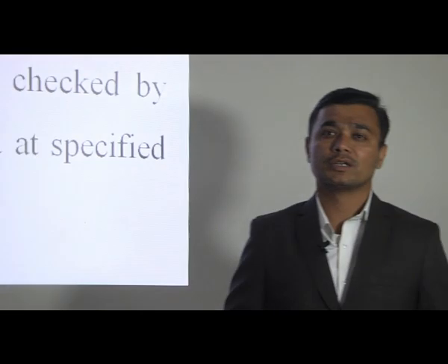The parenteral dosage forms are evaluated by different tests: sterility test, pyrogen test, clarity test, leakage test, assay, and stability test. From these, today we'll discuss the sterility test and the pyrogen test. So the first one is the sterility test.